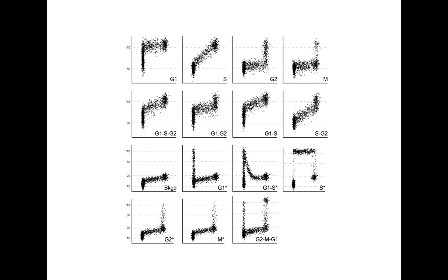In the third and fourth rows, expression rises and declines within a single phase, for example, the first, second, and fourth columns, or across phase boundaries, the third column. These are synthesized patterns based on ideas, but we and others have observed most of these patterns when looking at specific markers. In many cases, the compartments derived from these patterns are not unambiguous.